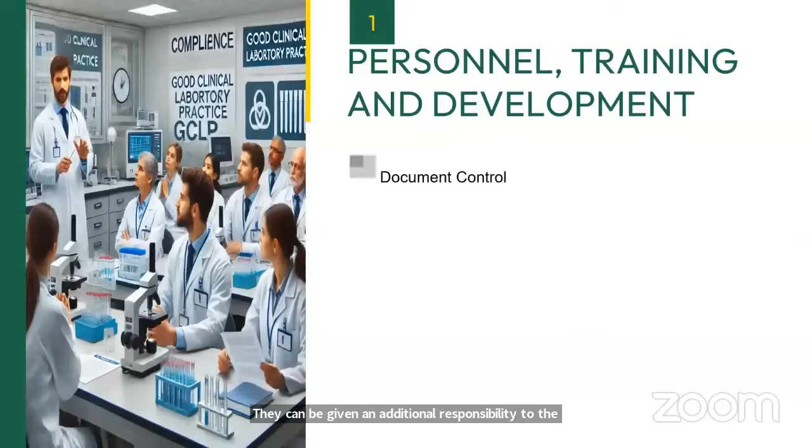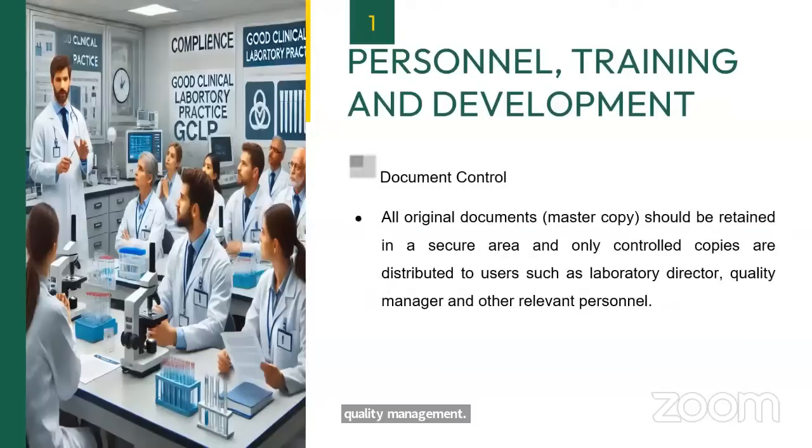Now, in addition, there is something which is called document control. So all the original documents should be retained in a secure area and only controlled copies are distributed to the users such as the laboratory director, quality managers and other relevant personnel. So as I mentioned yesterday also, whatever the policies are, whatever the procedures are, all those should be documented and they should be maintained under appropriate document control.